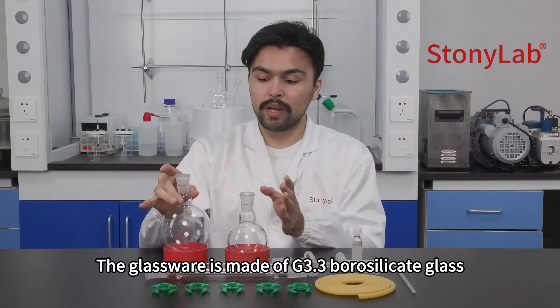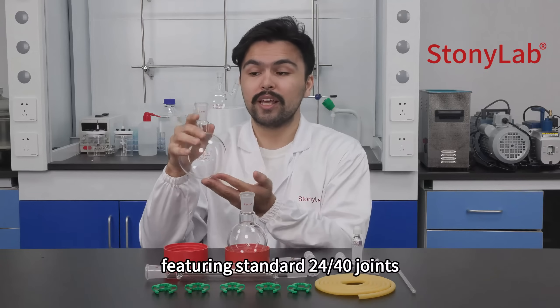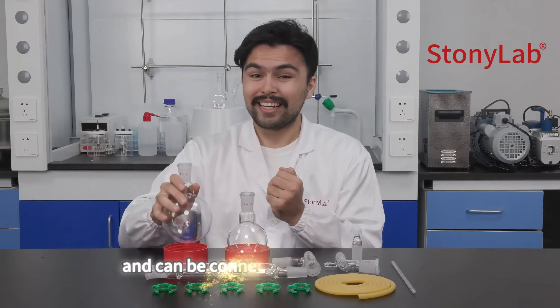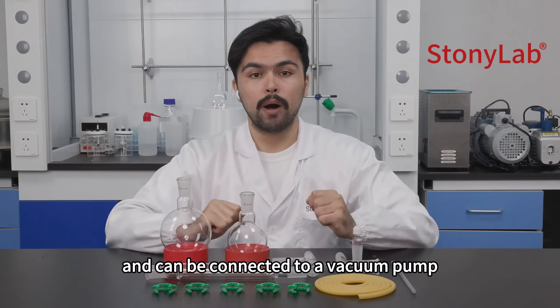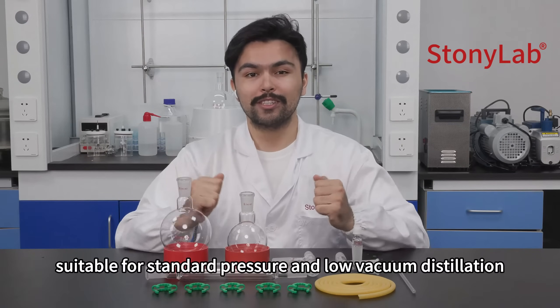The glassware is made of G3.3 borosilicate glass, featuring standard 24 by 40 joints, and can be connected to a vacuum pump, suitable for standard pressure and low vacuum distillation.